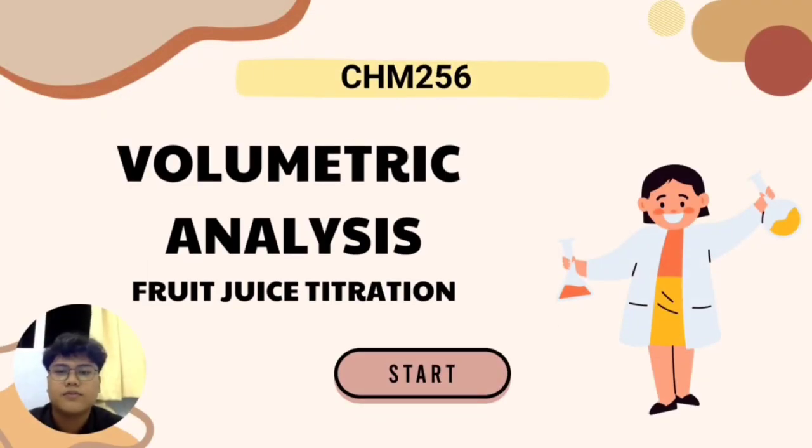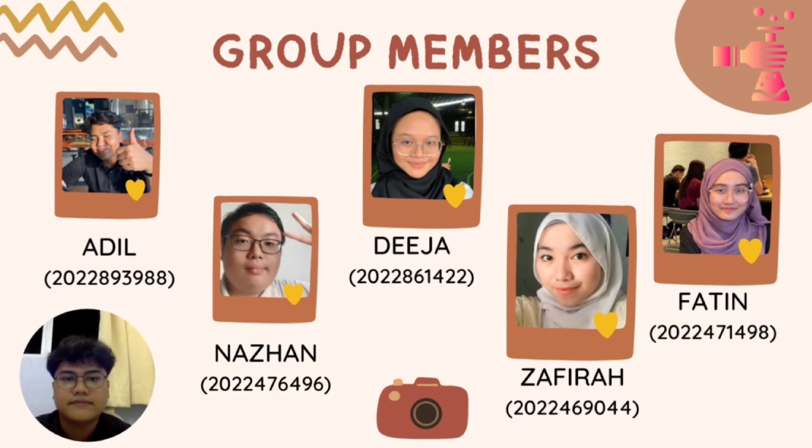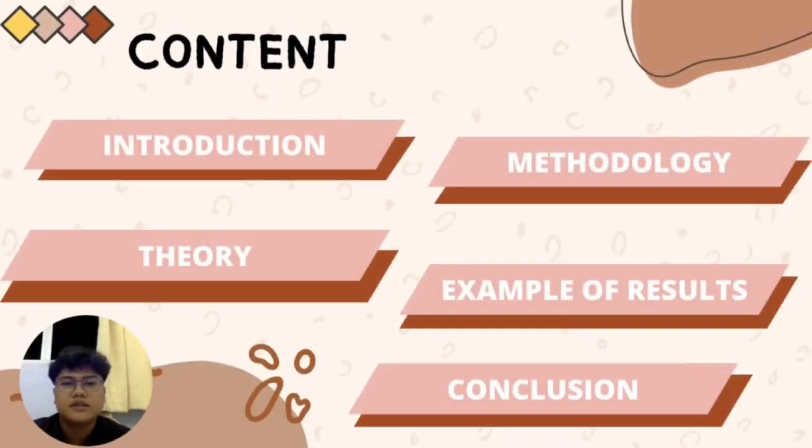So our group will present our topic, volumetric analysis of fruit juice titration. So this is our group member. In this presentation, there will be introduction, theory, methodology, example of results, and conclusion.